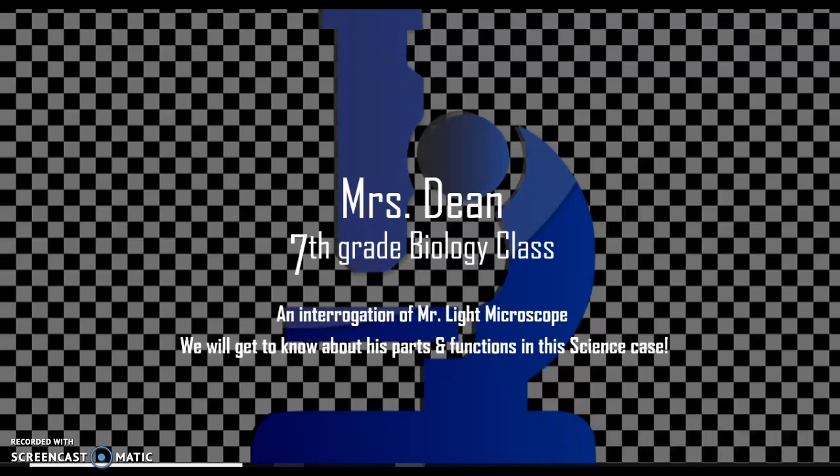Our first lab lesson will be over safe use of the microscope, and then we'll investigate and uncover the mystery of this wonderful instrument. As our title indicates, we are going to do an interrogation of Mr. Light Microscope. We will get to know about his parts and functions in this science case.